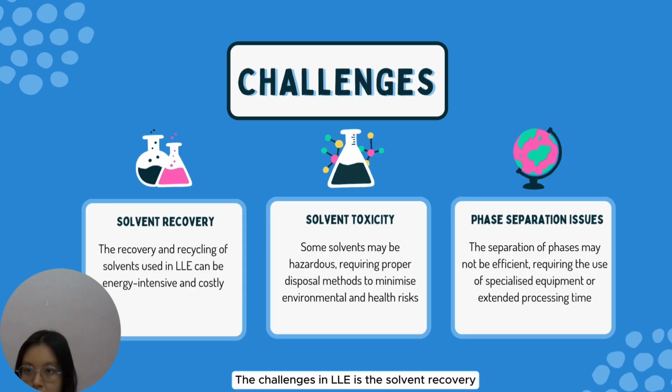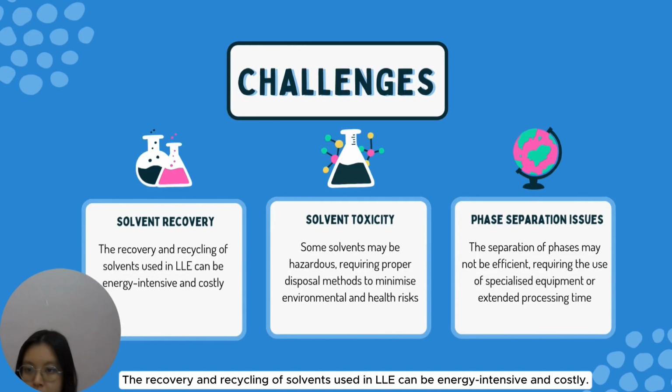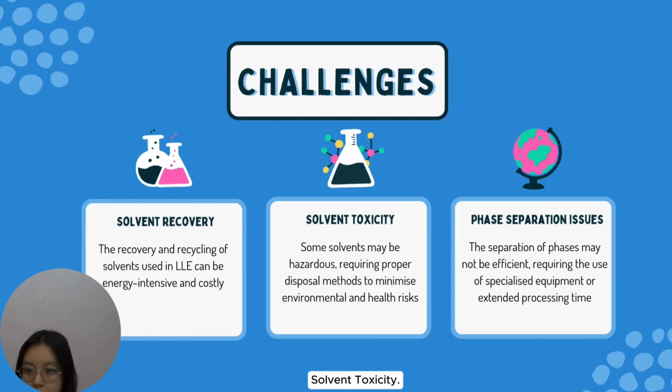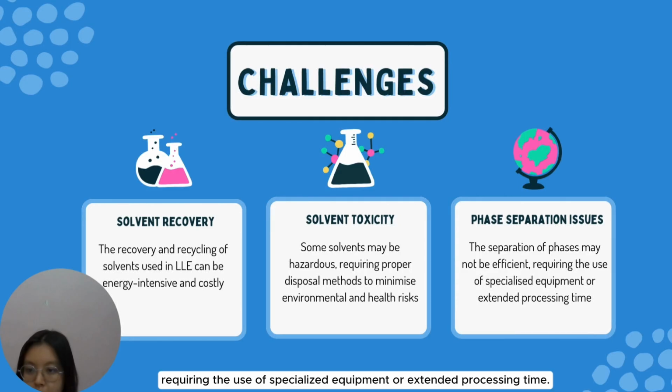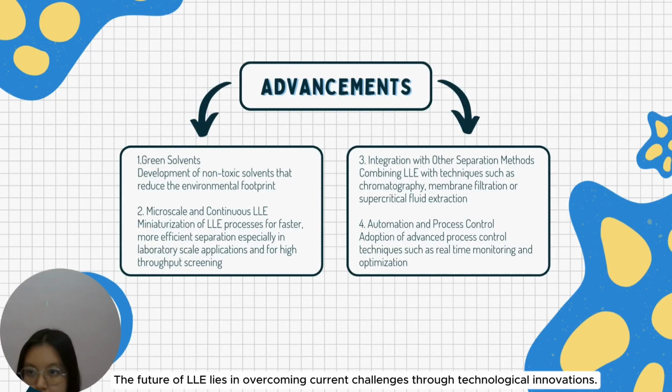The challenges in LLE is the solvent recovery. The recovery and recycling of solvents used in LLE can be energy intensive and costly. Solvent toxicity. Some solvents may be hazardous, requiring proper disposal methods to minimize environmental and health risks. Phase separation issues. In some cases, the separation of phases may not be efficient, requiring the use of specialized equipment or extended processing time. The future of LLE lies in overcoming current challenges through technological innovations.